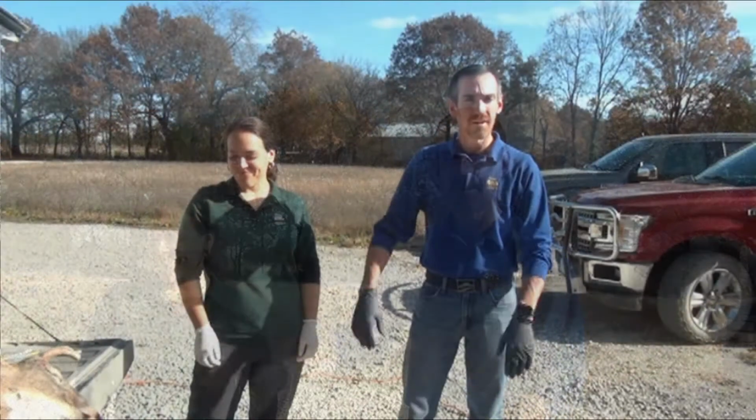I'm here with our state wildlife veterinarian, Dr. Rachel Rudin. Today we are with Tim and Joel, and we're going to show you how to collect a tissue sample for chronic wasting disease testing so that you can both help with our surveillance goals and also help make informed consumption decisions. So we have a deer here on the back of our tailgate.